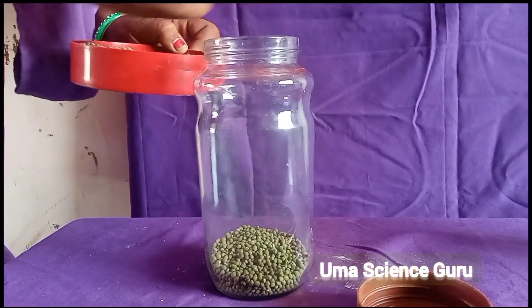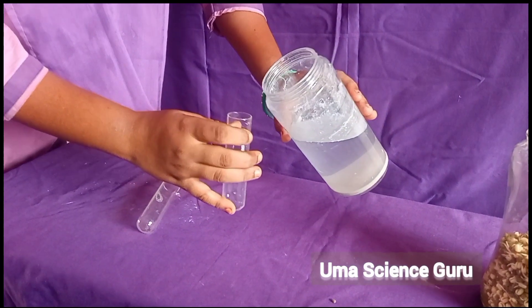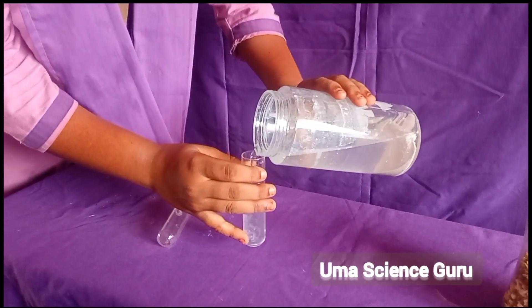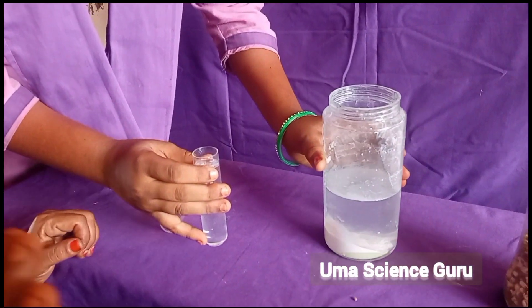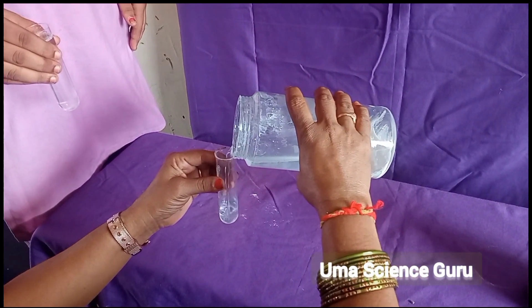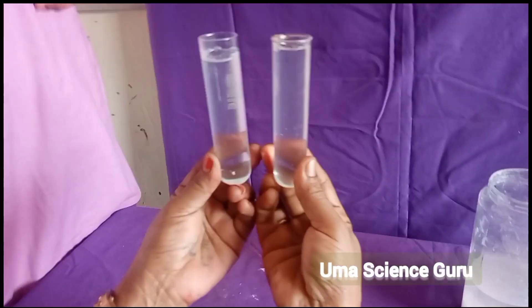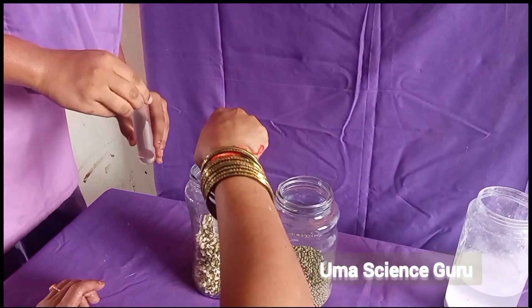Take two test tubes and fill them three-fourths with lime water. After that, place each test tube in each bottle.